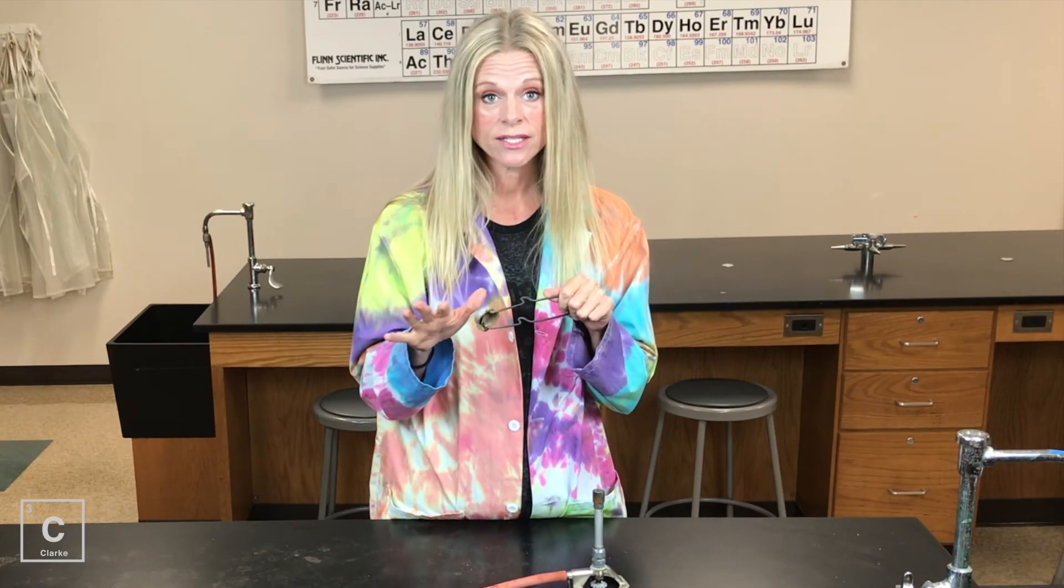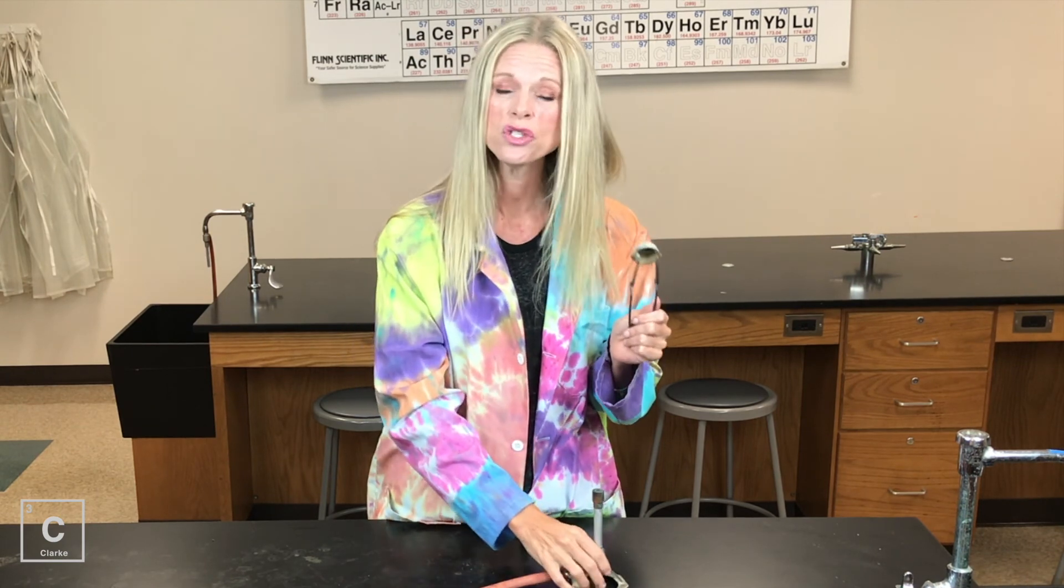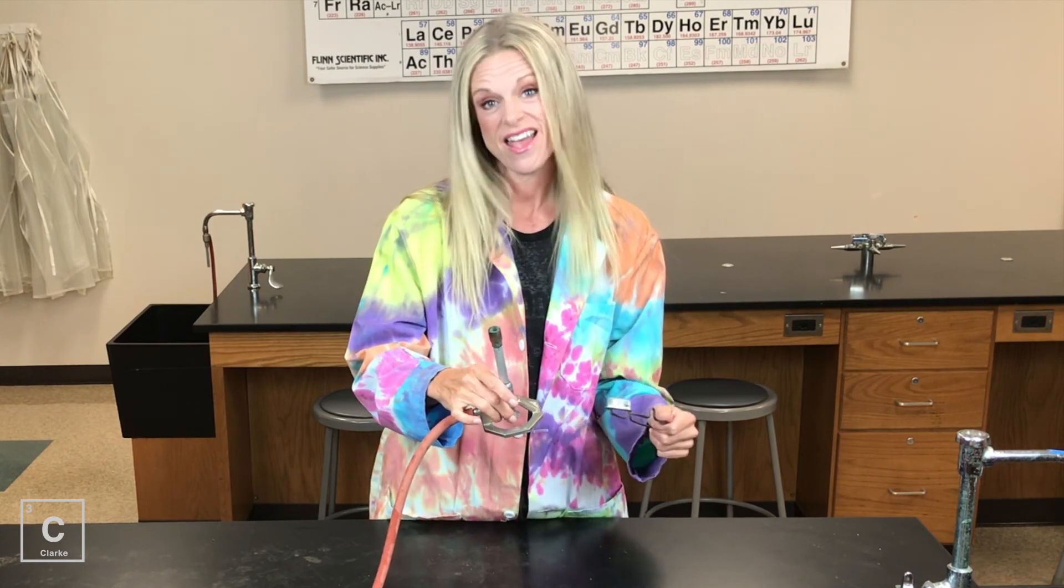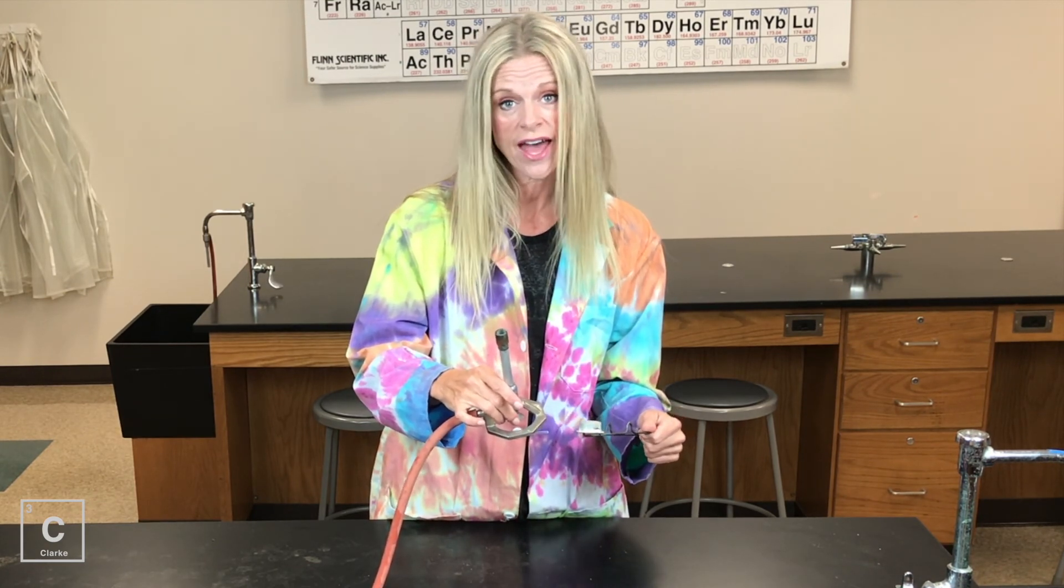Okay guys, as you start going into the lab and lighting your Bunsen burners with these strikers, I'm just going to be real honest with you. It does take a little bit of practice, but you can do it. Don't give up. It's all about applying that pressure down and across at the same time. Also, don't be afraid to adjust your fire on your Bunsen burners to get that nice hot roaring blue fire. Every chemistry teacher is going to be looking for that. Okay?